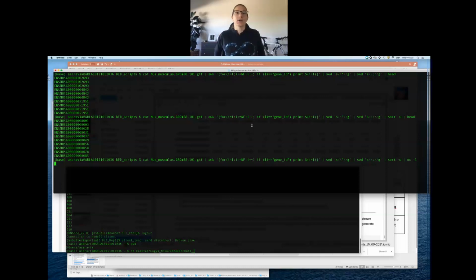But also, a lot of those functions that I do in Unix, there's Python ways to do it too. So a lot of you who are more comfortable in Python could probably figure out how to do this in Python. And again, I'm just doing this stuff to do some troubleshooting, right?